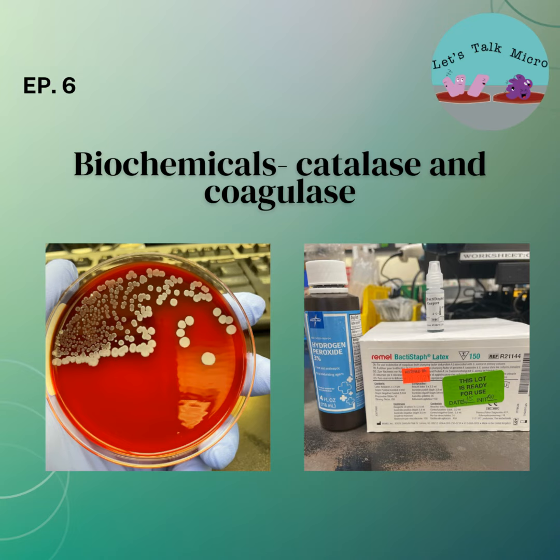It is an enzyme that catalyzes the release of water and oxygen from hydrogen peroxide. How do we perform this? Well, very simple. We add a drop of hydrogen peroxide to a slide, and then we apply a colony to that drop. Alternatively, you can add the colonies to the slide and then add the drop of hydrogen peroxide. So I mentioned that you can use it for gram-positive cocci and gram-positive rods, but this is one of the main biochemicals that differentiates Staphylococcus from Streptococcus.